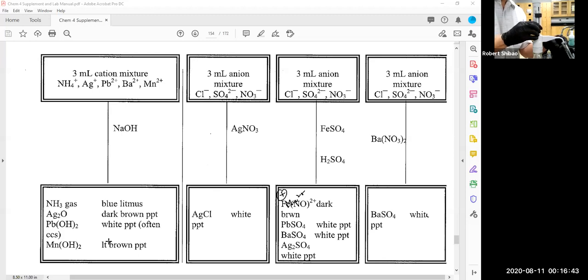and then just slowly depress it. I rotate it so I can get a nice drop rate. I don't want to mix it too fast because I want this sulfuric acid to sink to the bottom like syrup. I don't want it really to mix with the water because I want that brown ring. Okay, now let's take a look.